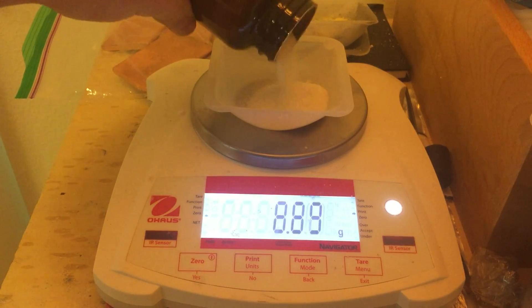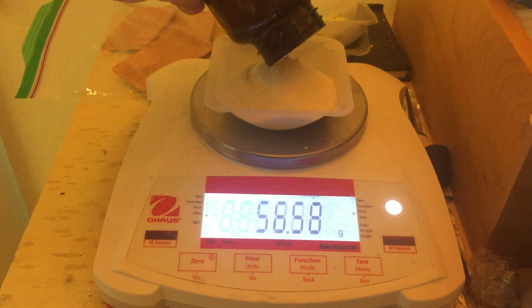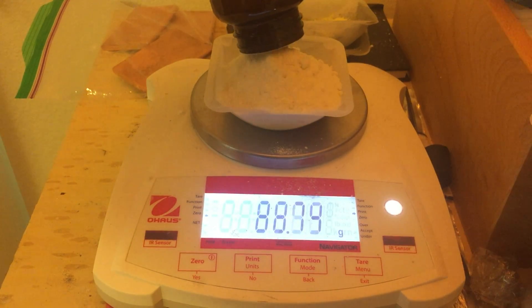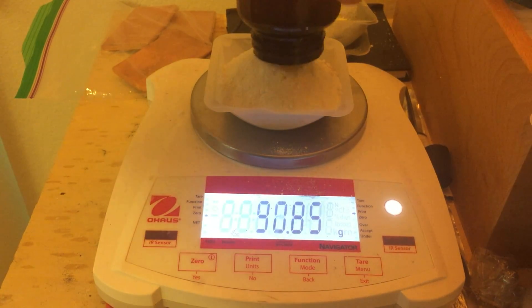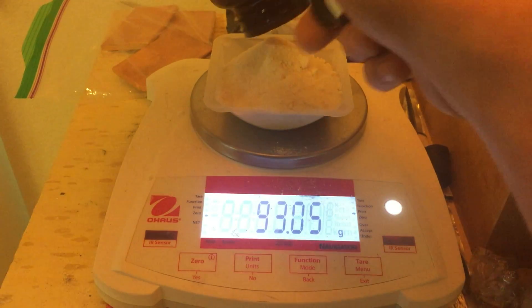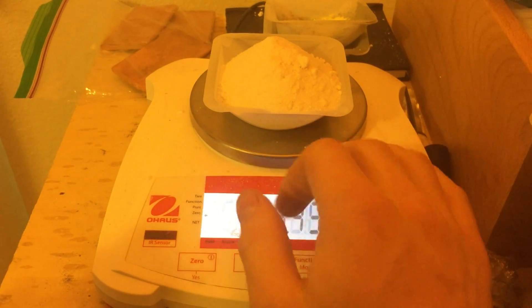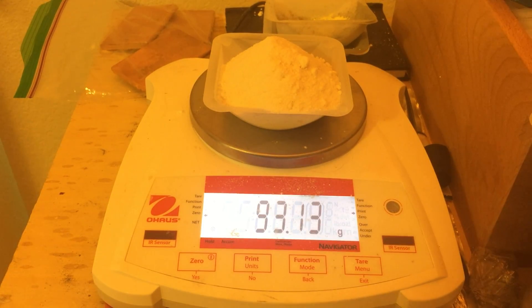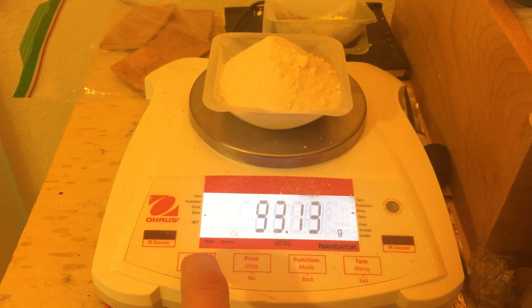First I needed to weigh out the reactants. Earlier this week, I made some crude ammonium sulfate by reacting ammonia cleaning solution and sulfuric acid drain cleaner. Purity isn't a huge issue in this reaction though, and some impurities won't affect the end product. In total, I had 93.15 grams of ammonium sulfate.